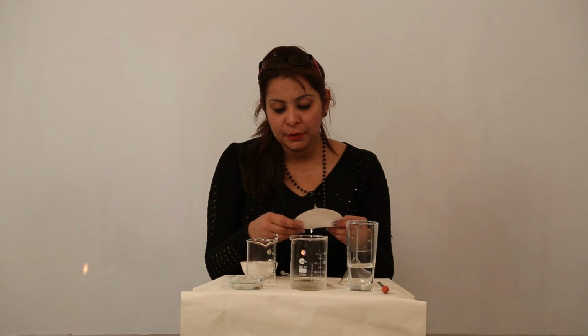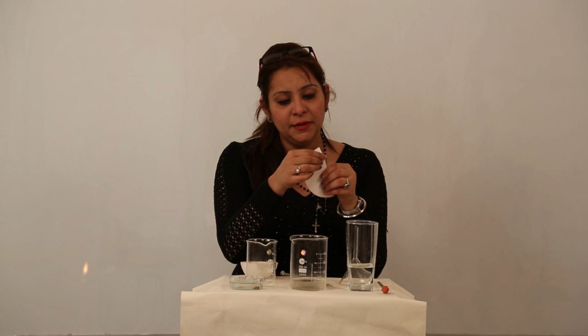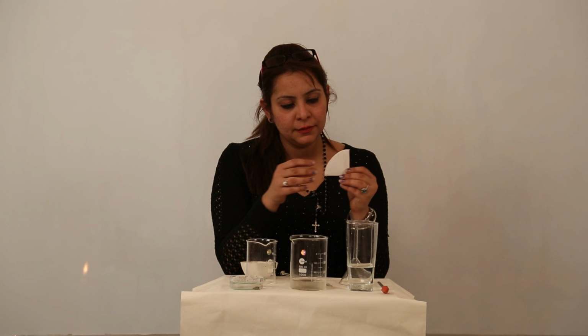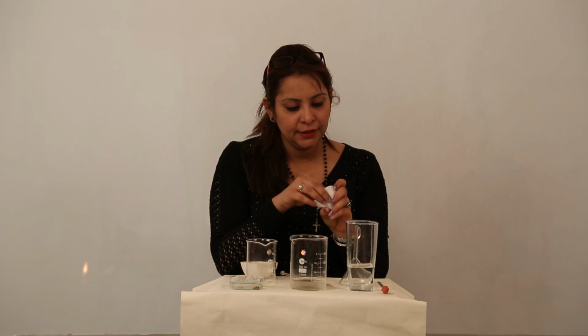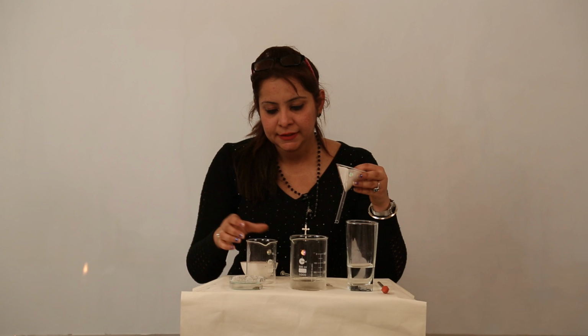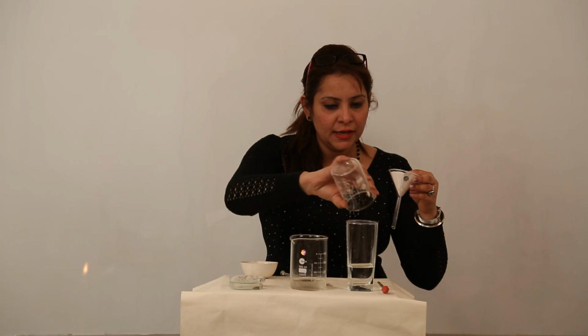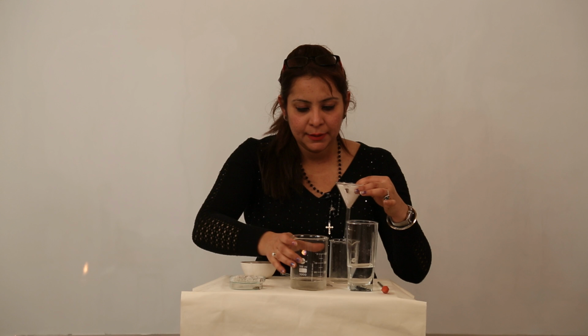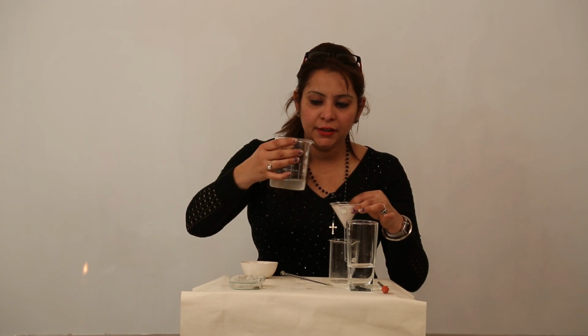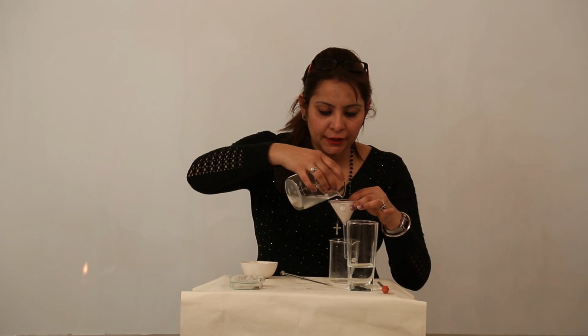So I am using a filter paper. You know how to use it now, I have told you in the previous experiments as well. We are folding it, making a cone-like shape, and fixing it in the funnel so that it resembles the mouth of the funnel, a cone shape. I have put it in like this, and now I have put this almost empty beaker under it, and I am pouring in the solution which contains the mixture of sand and salt.